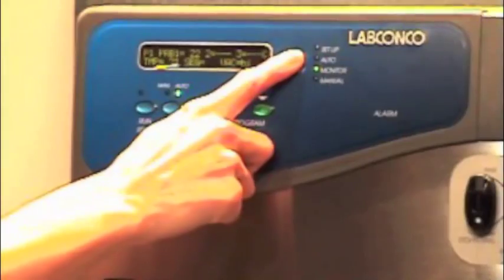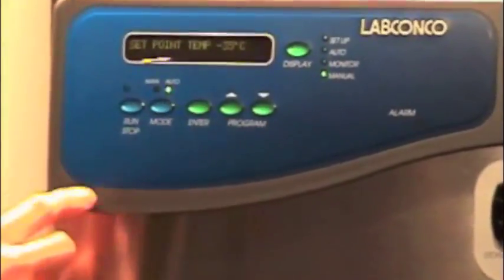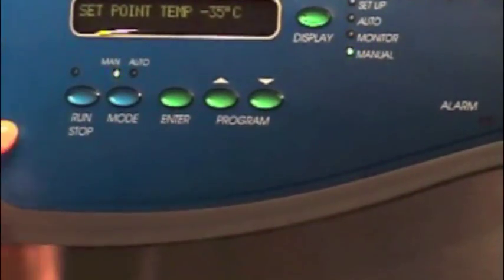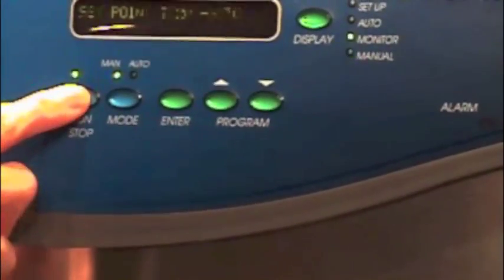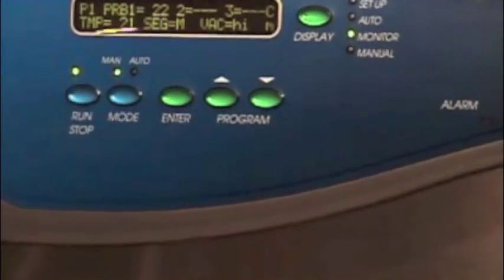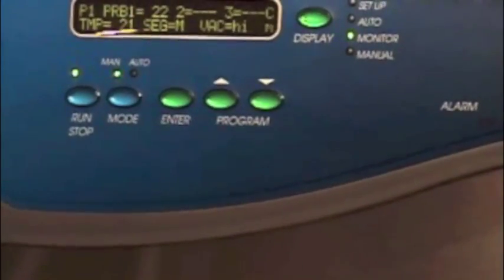Before running in automatic mode, it's best to perform a trial run in manual mode in order to determine appropriate set points.